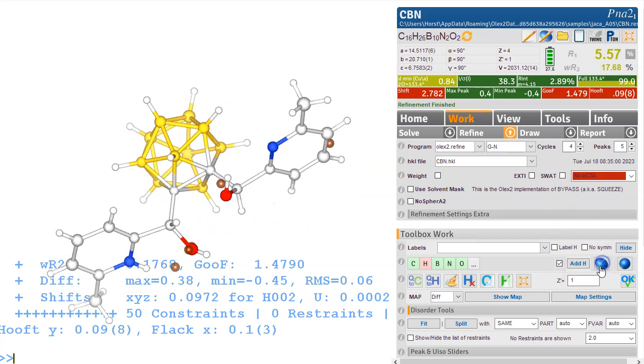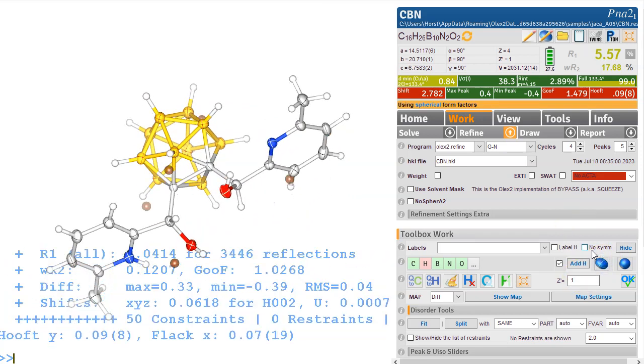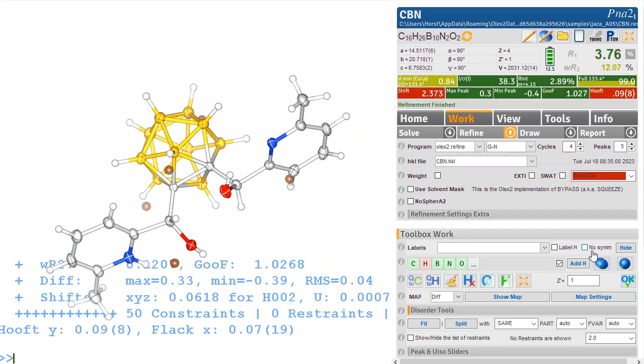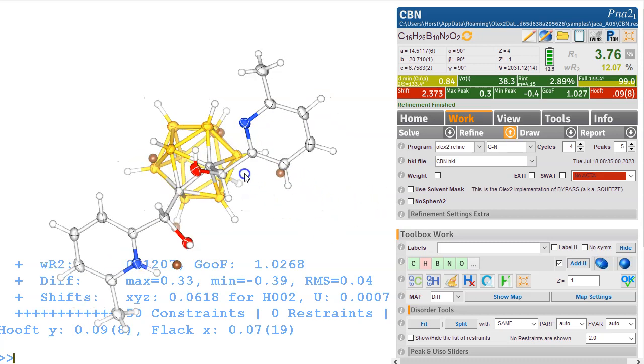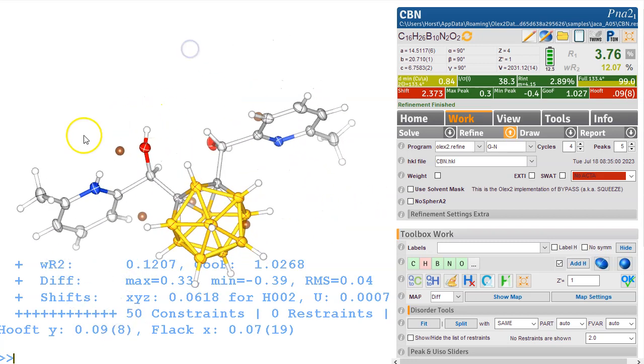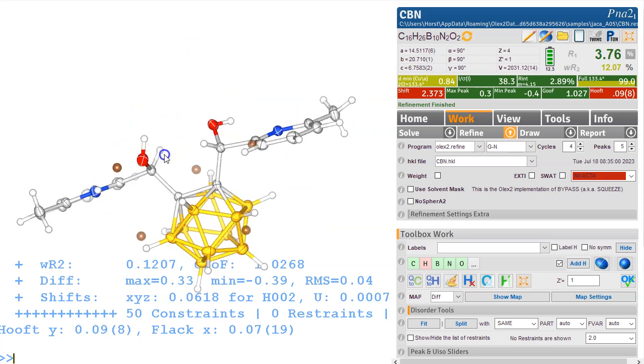Let's make it anisotropic. It doesn't really matter which way around you do it, anisotropic first then hydrogen atoms, or often it's better to do it anisotropic first, but it doesn't really matter. So here we can already see this hydrogen needs to turn around.